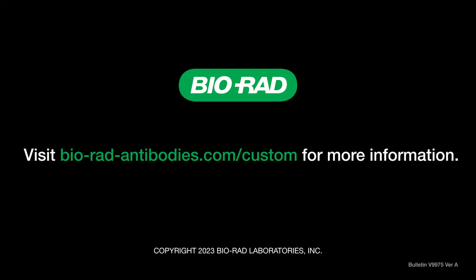Whereas if your target is a larger protein, we're likely to have many more antibodies within our library that can bind. So those with the higher affinities would compete off any of those lower affinity clones. And in this example, we might be able to reach affinities even better than single-digit nanomolar. We can always perform affinity maturation on a clone if there does need to be an improvement in the affinity of that antibody to the target antigen. And it's important to mention that when we do measure our affinities, that's done in a monovalent Fab format. So you can see improvements with an avidity effect if you're looking at a bivalent antibody.